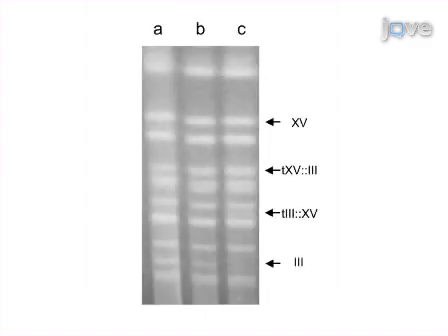Chromosomal blot analysis can also be employed to examine translocation-bearing clones. Intact chromosomes prepared in agarose plugs are separated by CHEF electrophoresis, and the gel is stained with ethidium bromide and visualized under UV light.